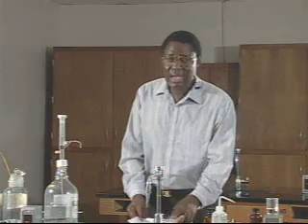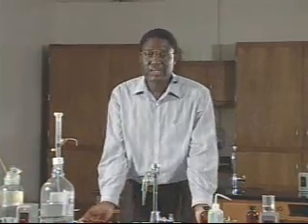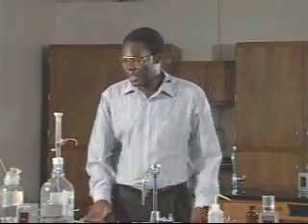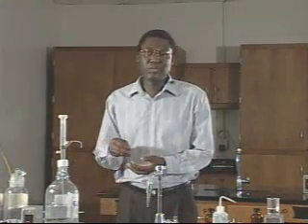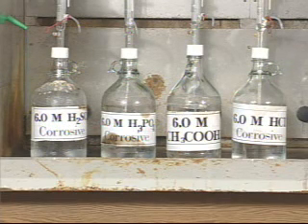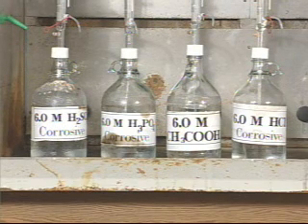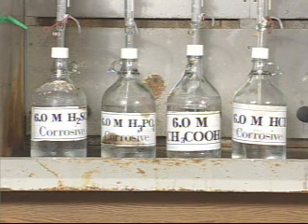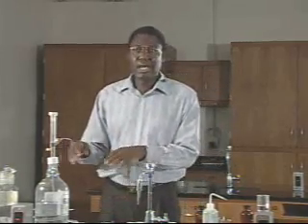We will move on to the third experiment, which looks at the reaction of different acids. Again, we will take granular zinc and react it with four different acids: acetic acid, hydrochloric acid, phosphoric acid, and sulfuric acid — all at a concentration of 6 molar. Then do your reactions and observe.